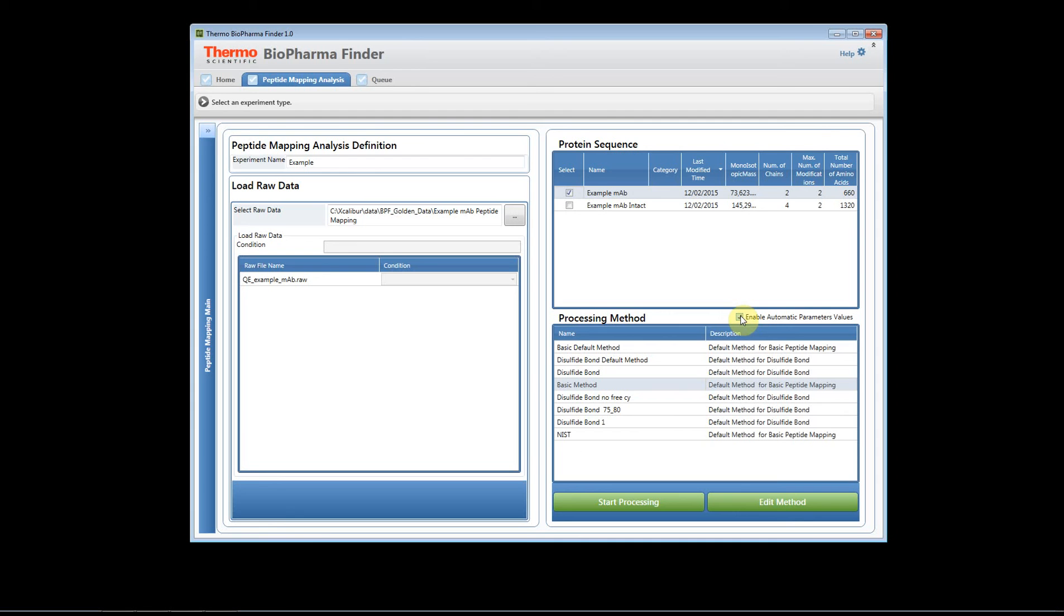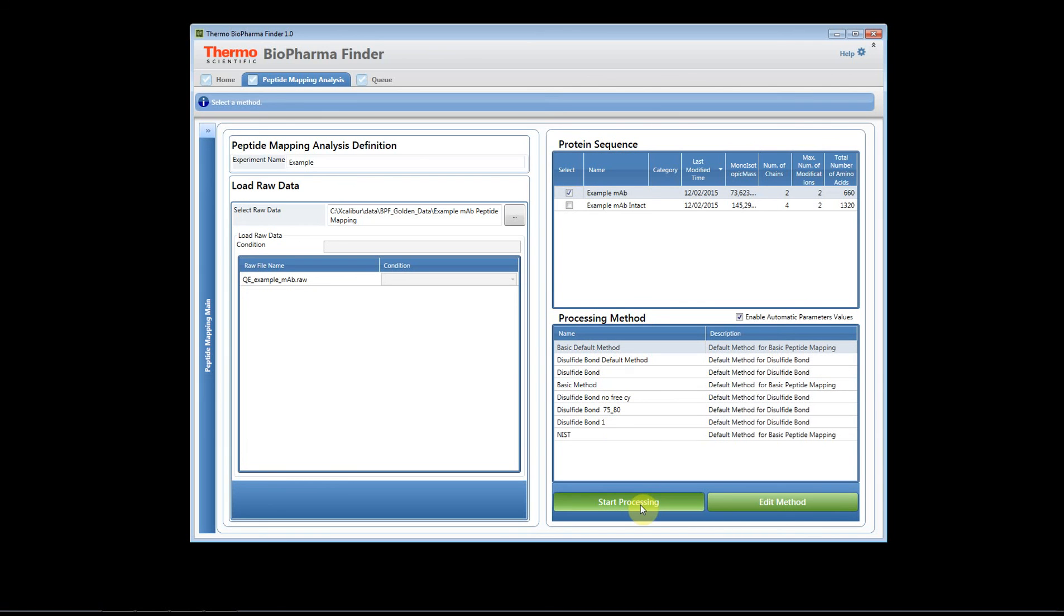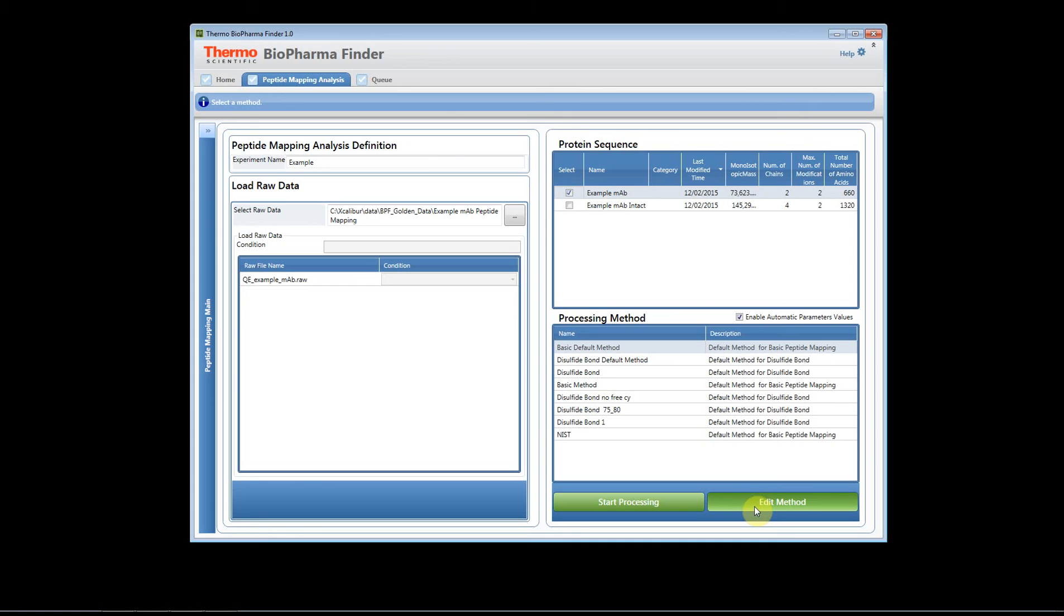Okay, so now that you have your experiment named, you have your raw files, you have your sequence, you've selected your method, you can either start processing or edit the method. Again we recommend you edit the method so you can look at the parameters and adjust them for your raw files.